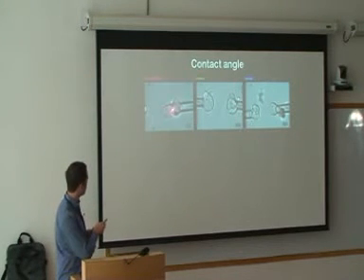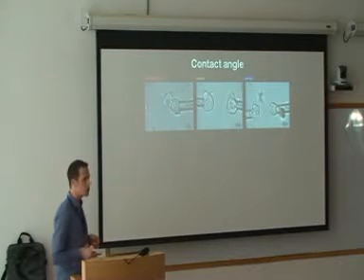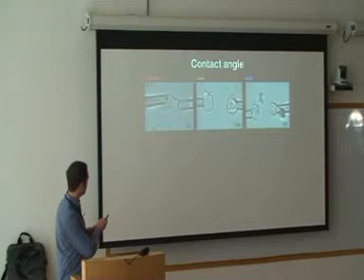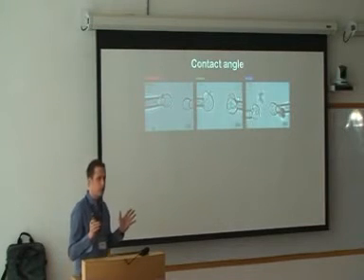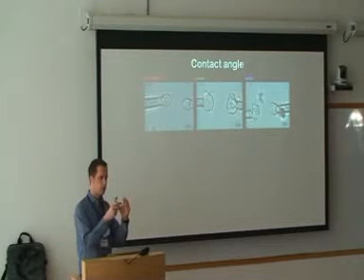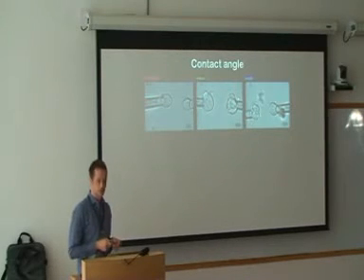It looks pretty chaotic, but if you do it in a systematic way, you can learn something out of it, and you watch how these cells are forming cell-cell contacts. So basically you look at the doublet, and then you can dissociate them again. But you watch how this doublet goes into a steady-state configuration where it has a specific contact area which corresponds to the surface tension of this doublet.